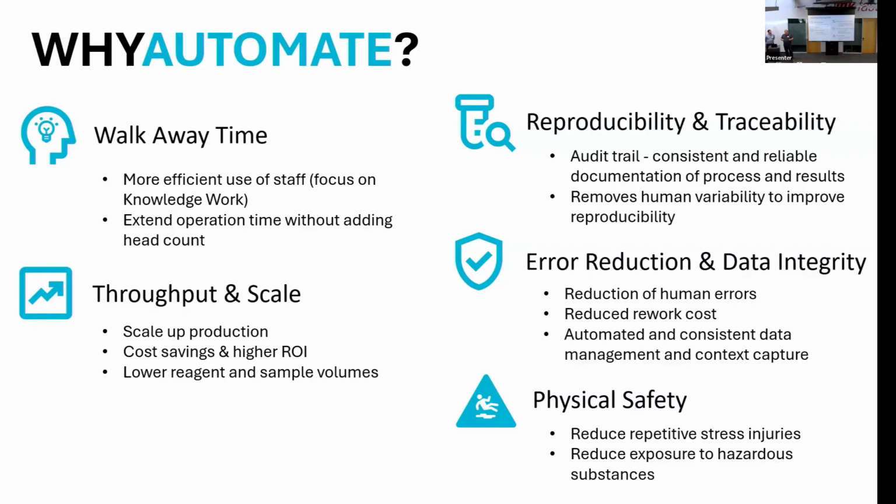What was the real incubation time? And then again, data integrity. How many times do you see people moving Excel files around on flash drives, copying things out or pulling the wrong lists, because of that human-in-the-loop concern? So again, as you're looking at these things, these are all keys.